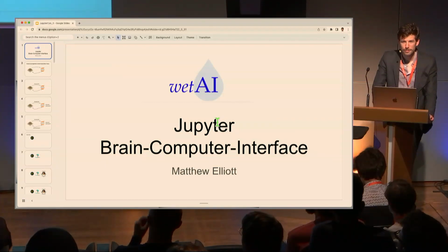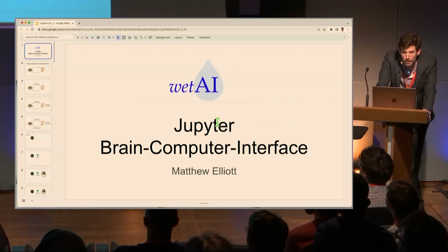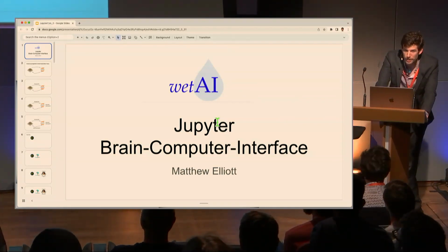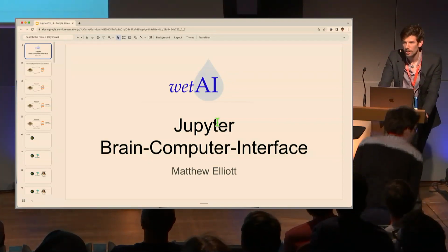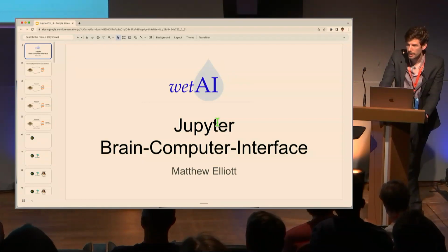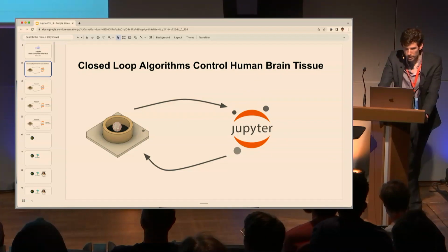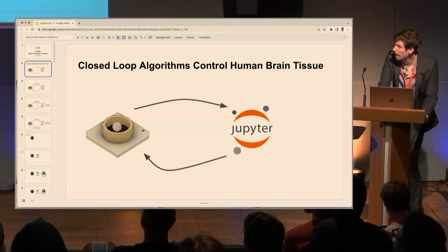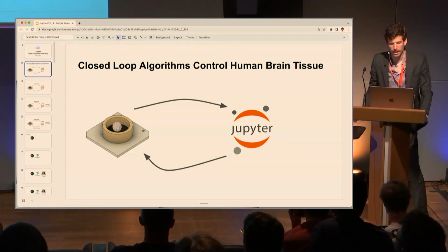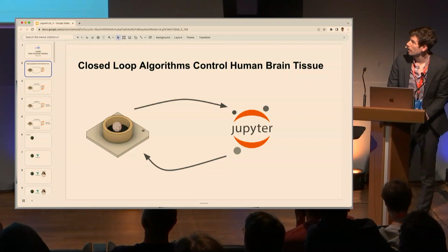Hello, everyone. My name is Matt Elliott, and today I'm going to be presenting my lab's work in using Jupyter as a brain-computer interface. We colloquially call the platform that we created WetAI, as in artificial intelligence on wet lab biology.